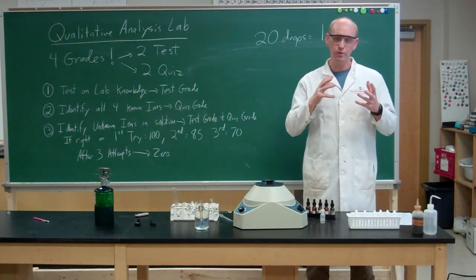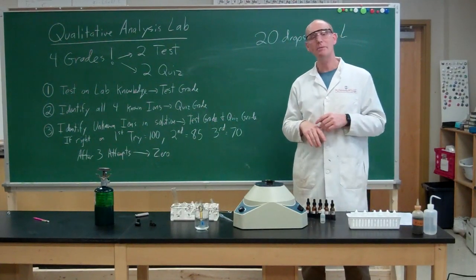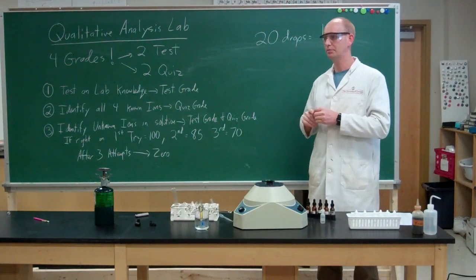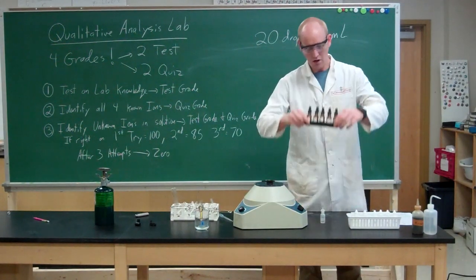And if it glows, that's called fluorescence, and we know that there's aluminum there. If it doesn't glow, there's probably not any aluminum. And I'll make sure to show y'all this before y'all do the test, the procedure for shining it and what the fluorescence should really look like.